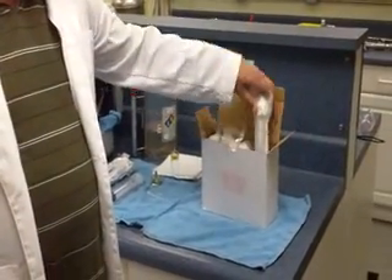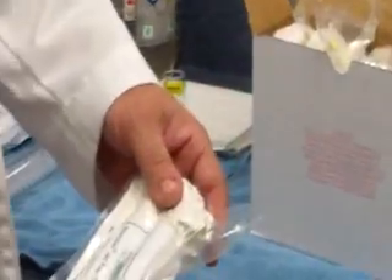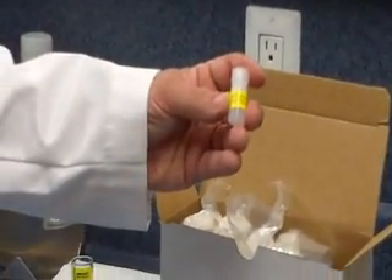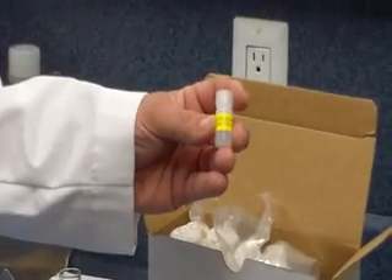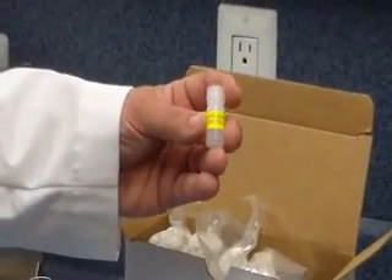The six packs come with six test kits, such as this. They're vacuum packed to keep moisture out. Inside that six pack, you will also receive a bottle of distilled water. We prefer to use distilled water because deionized water, as well as tap water, will skew the results of the test.